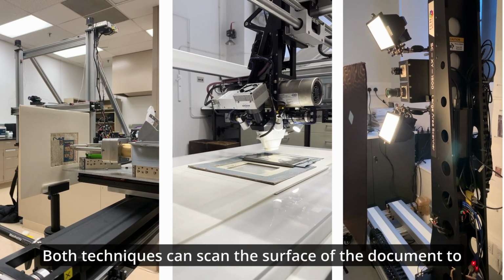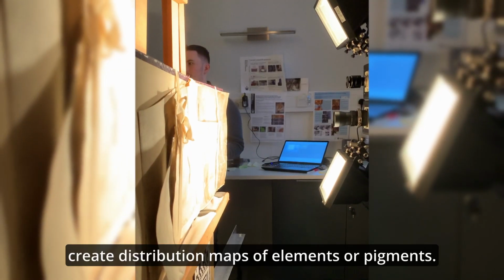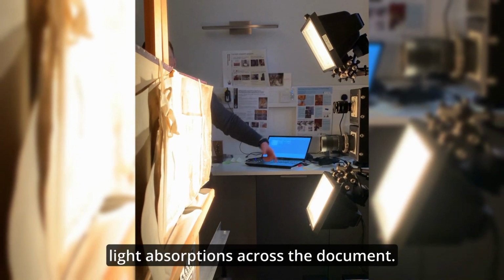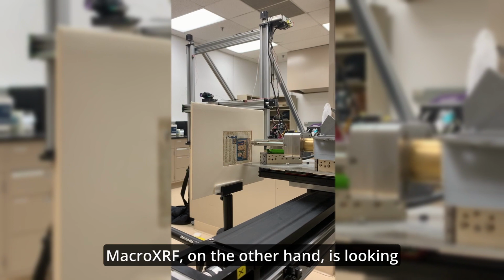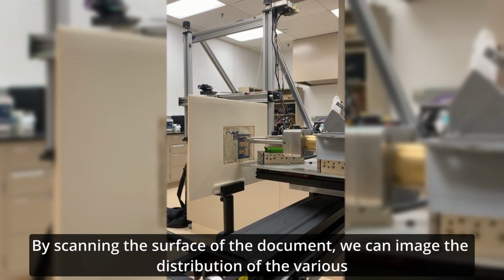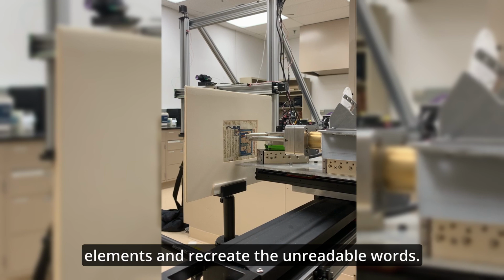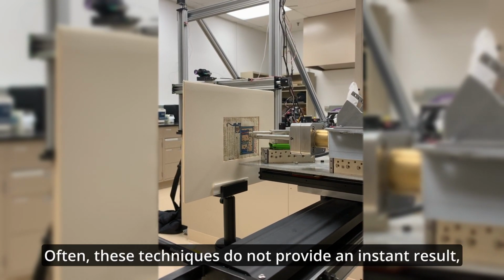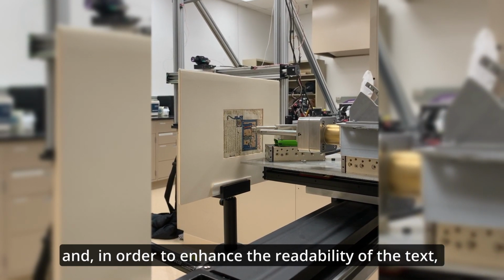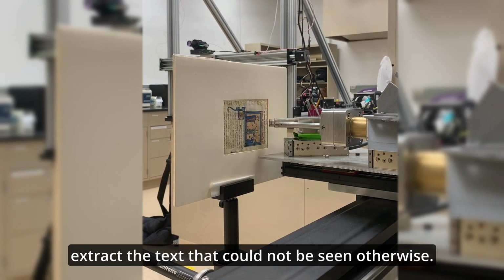Both techniques scan the surface of the document to create distribution maps of elements or pigments. The hyperspectral imaging helps visualize variation in light absorption across the documents. Macro-XRF, on the other hand, is looking at the elemental composition of the ink. By scanning the surface of the documents, we can image the distribution of the various elements and recreate the unreadable word. Often, these techniques do not provide an instant result, and, in order to enhance the readability of the text, we need to apply various types of complex algorithms to extract the text that could not be seen otherwise.